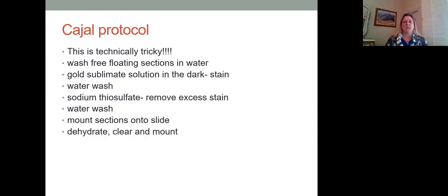It goes in and it cleans up all sorts of unreacted silvers or gold for you. Sodium thiosulfate will go into a stain and it will attach to a lot of things because it's hypotonic.